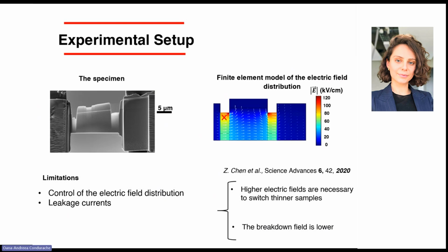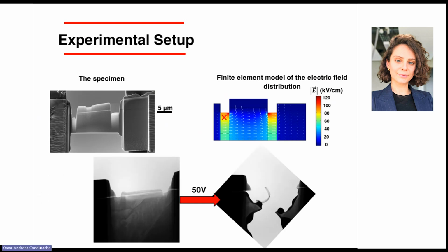And on top of that, it's known now that ferroelectrics that are very thin will switch at higher fields because of pinning on surfaces. And what can happen is that we have a sample which will break down before switching takes place. And if you work with ferroelectrics, you will notice probably in my next slides that the behavior is mostly a behavior of a ferroelectric in so-called low electric field, so a subcoercive field regime.